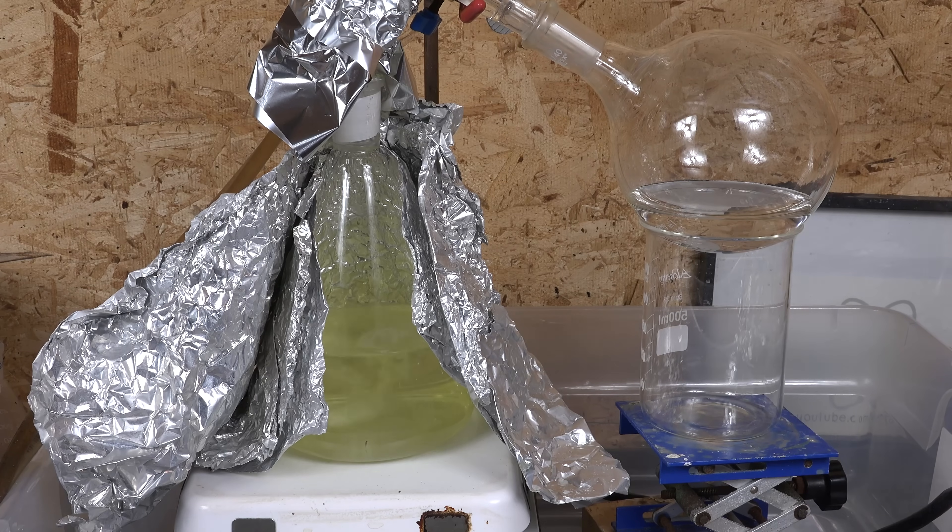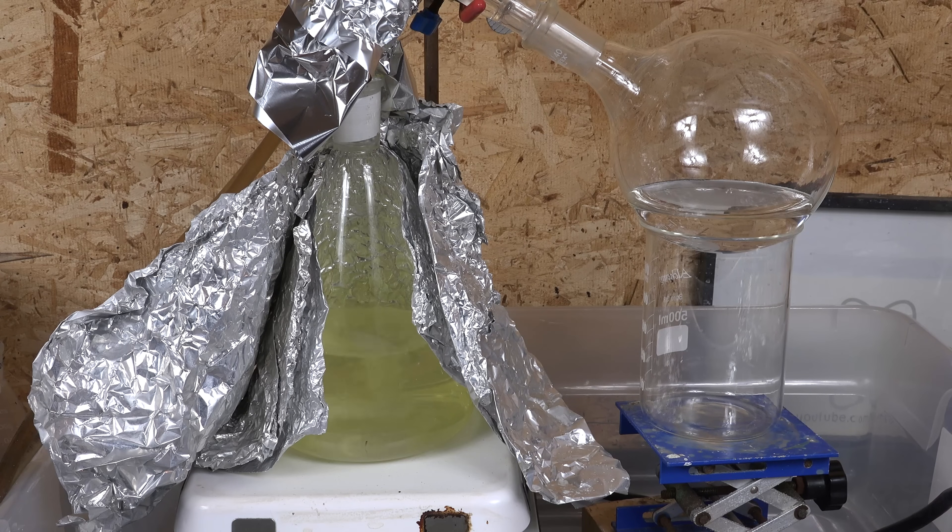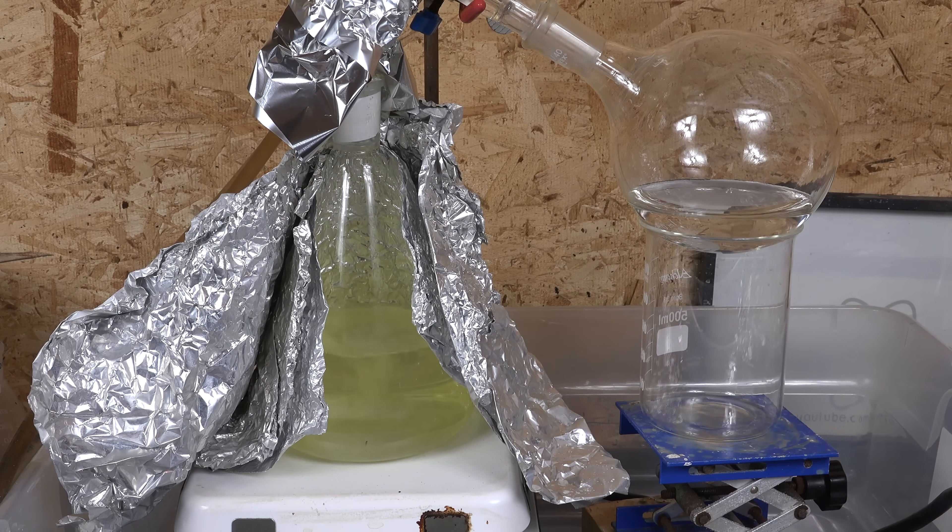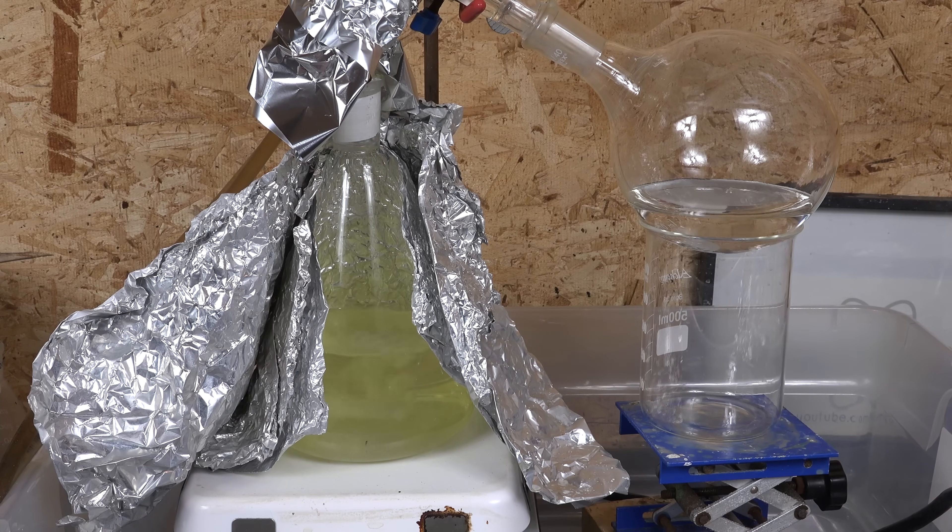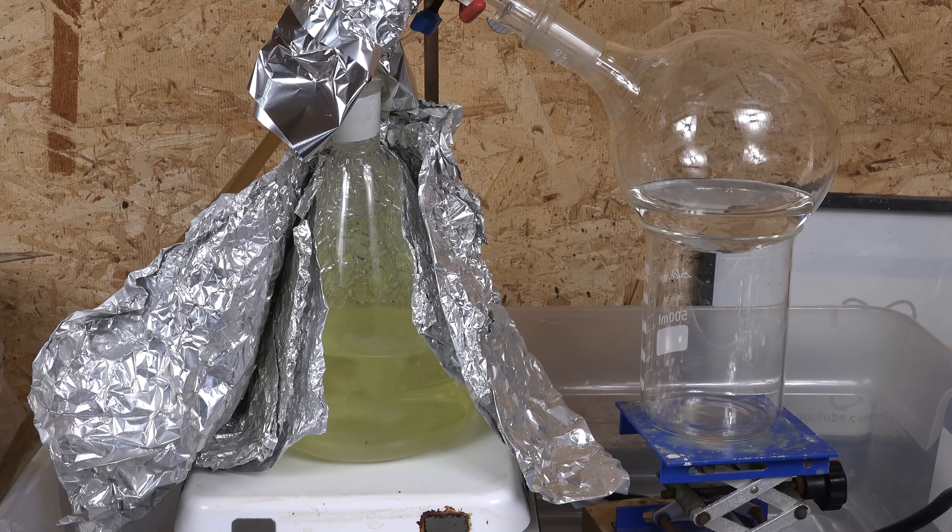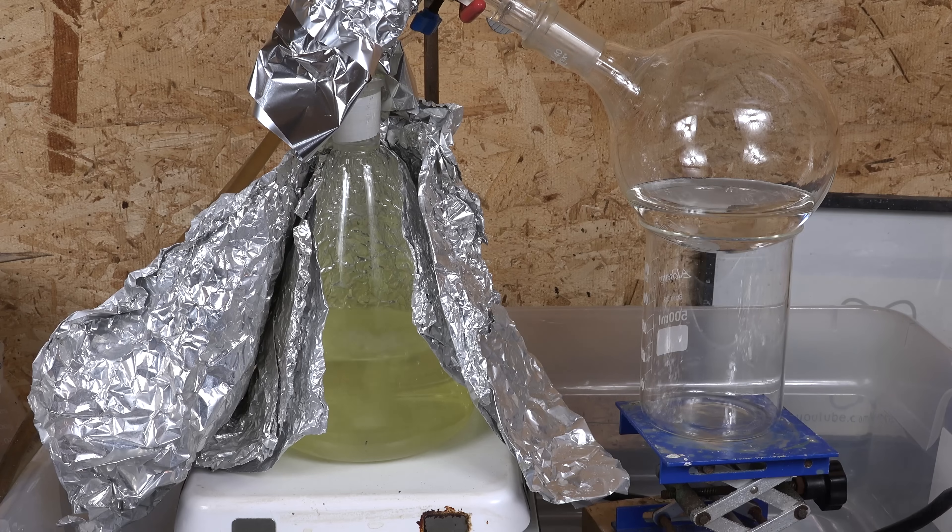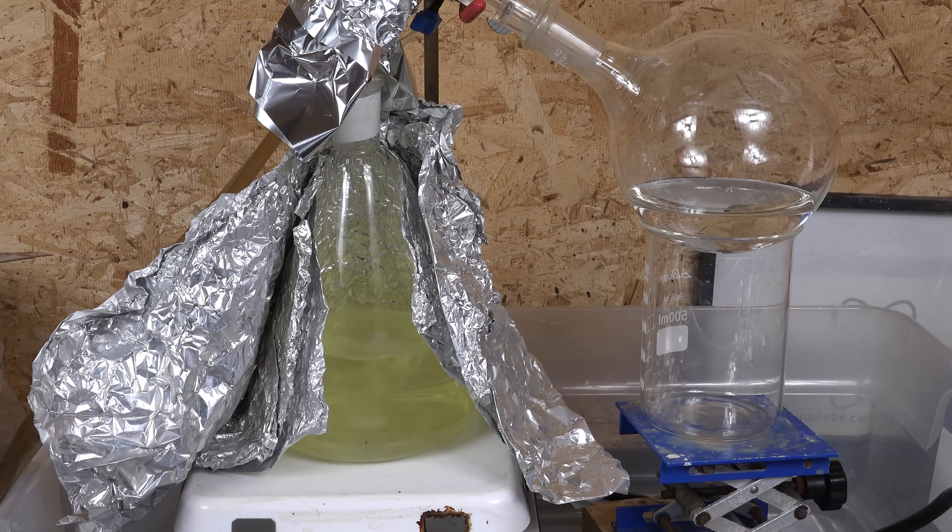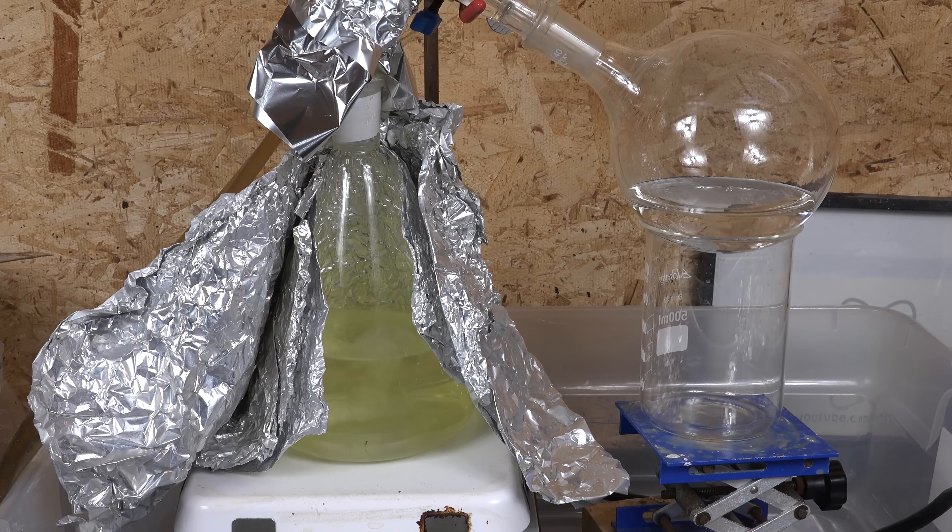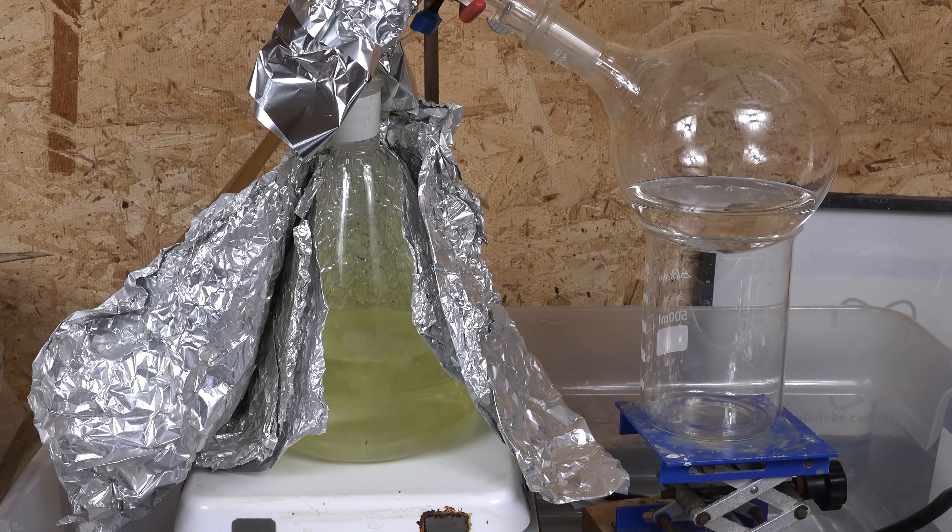So what do you do if you do have boiling sulfuric acid pooling around your lab bench? Best thing you should do is to keep your distance. Hot sulfuric acid may set things on fire or explode when it reacts with something, splattering the acid on you. So as said before, don't approach it while it's hot. Also do not neutralize it while it's hot. Pouring water or a base on hot acid can cause it to explode and splatter. And there have been some extremely horrific accidents where individuals have tried to do this. Wait until the acid is cold.